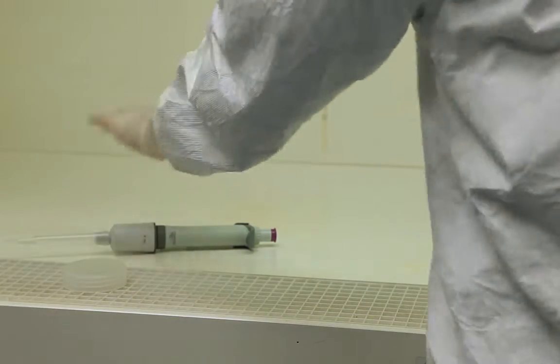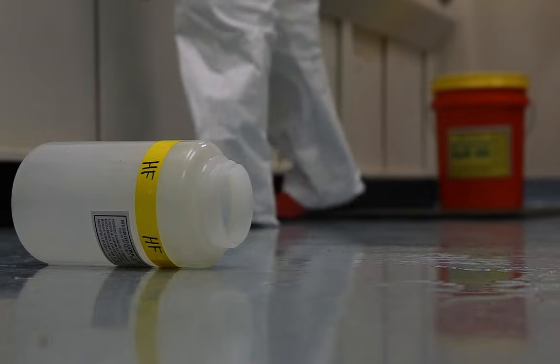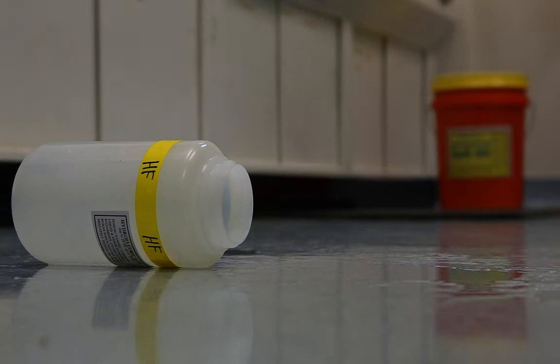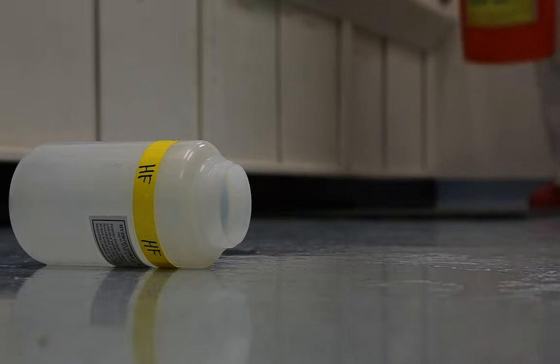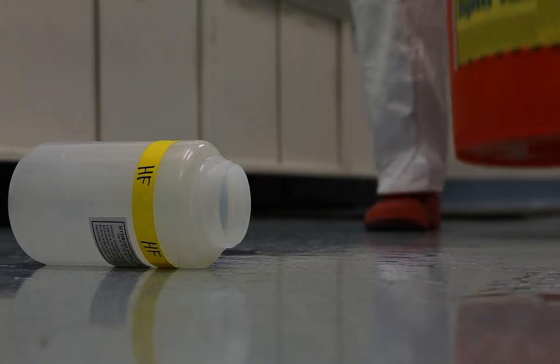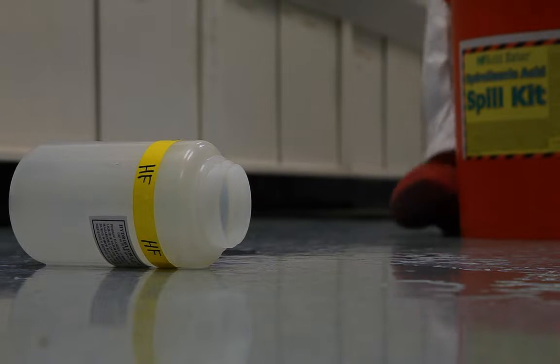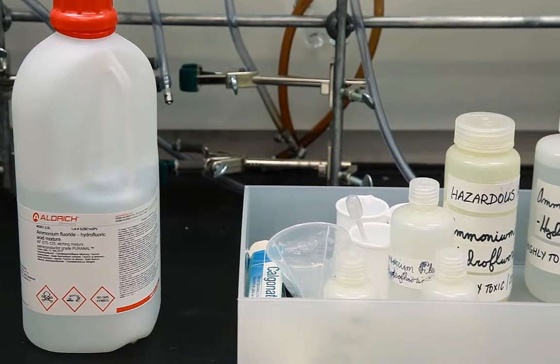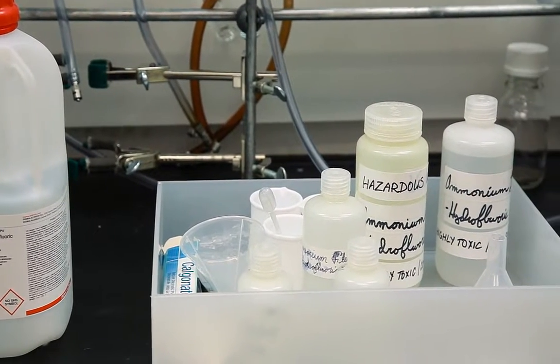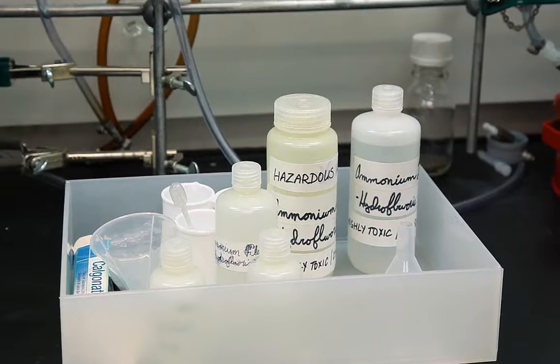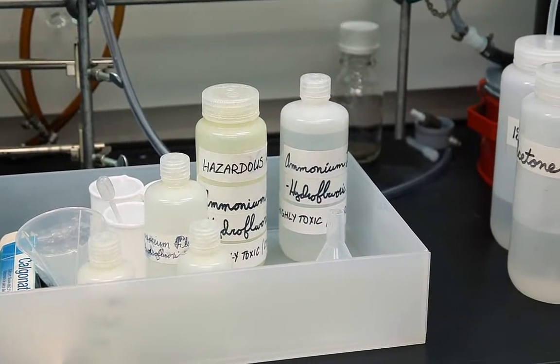HF will react with metals and metal oxides to form explosive hydrogen gas. Chemical bases, strong oxidizing agents, alcohols, amines, leather, and some types of rubber will also react with HF. Unless your lab has written procedure, contact with these materials must be avoided. Verify only compatible materials remain in your workspace.